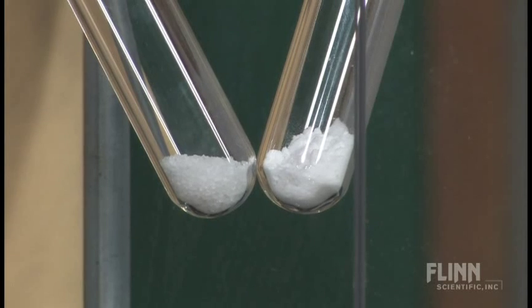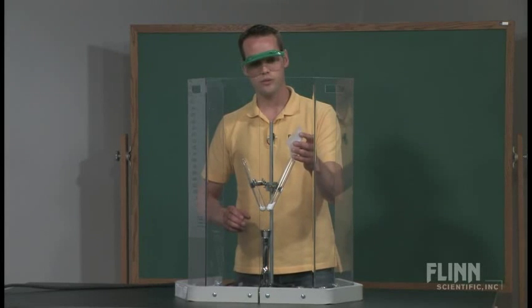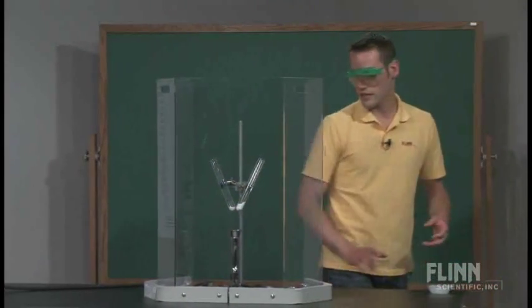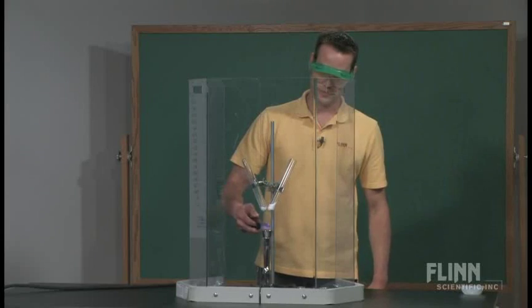When we start heating this up, you'll see the potassium chlorate going from KClO3 to KCl, and there'll be some oxygen as well. But the important thing for the demonstration is that you need to get these both into the liquid phase. So I'm going to heat these up with a Meeker burner. And if we can turn the gas on. Thank you.